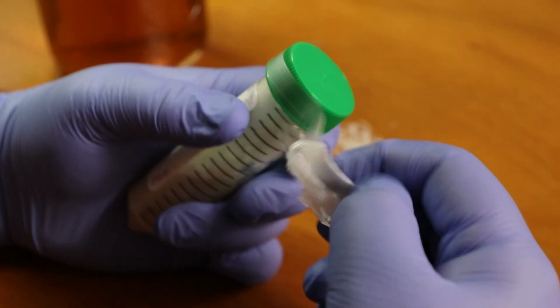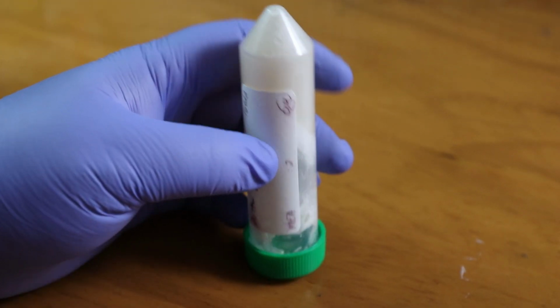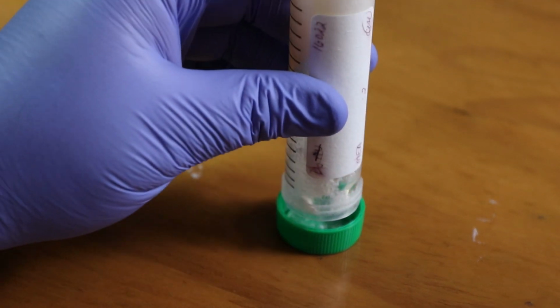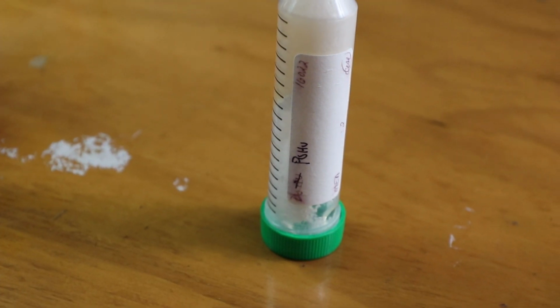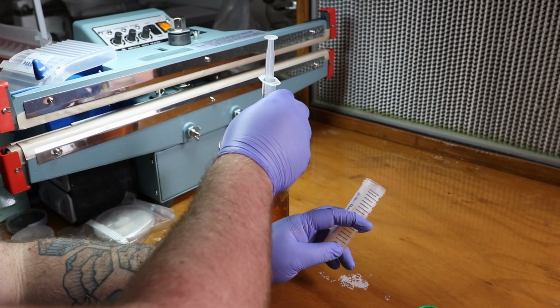Then you're going to unparafilm your dish, your culture, of course. And then I like to, if I'm working with slants, open the slants and then just set the slant back into the lid. This way it's easy to pick up and down, manipulate. Usually if I'm doing this, I'm doing multiple jars or dishes.